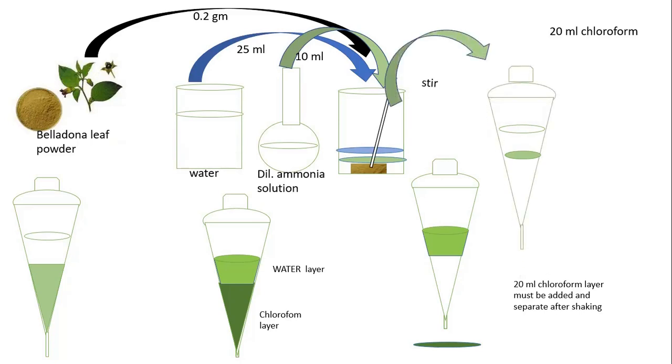Take a separating funnel. In that separating funnel, transfer that particular mixture. Add 20 ml of fresh chloroform in that separating funnel. Then shake it. After shaking, keep it aside for a few minutes. Here, the separation of two layers occurs. The upper layer is the aqueous layer, and the lower layer is the chloroform layer because chloroform is heavier than water.